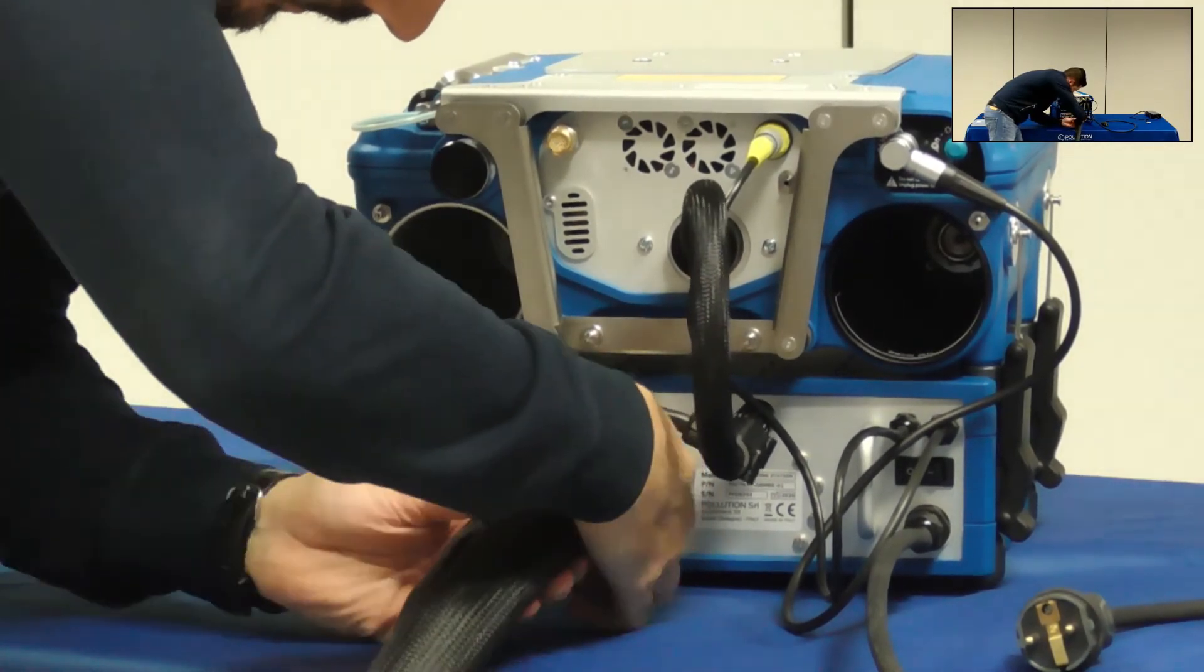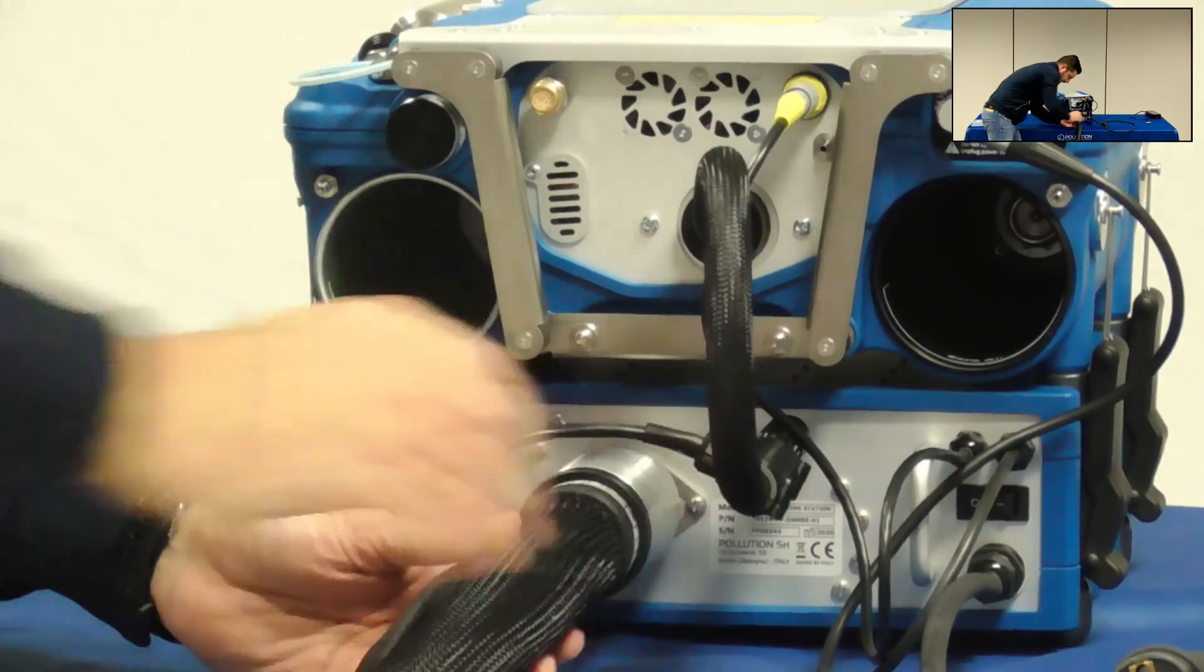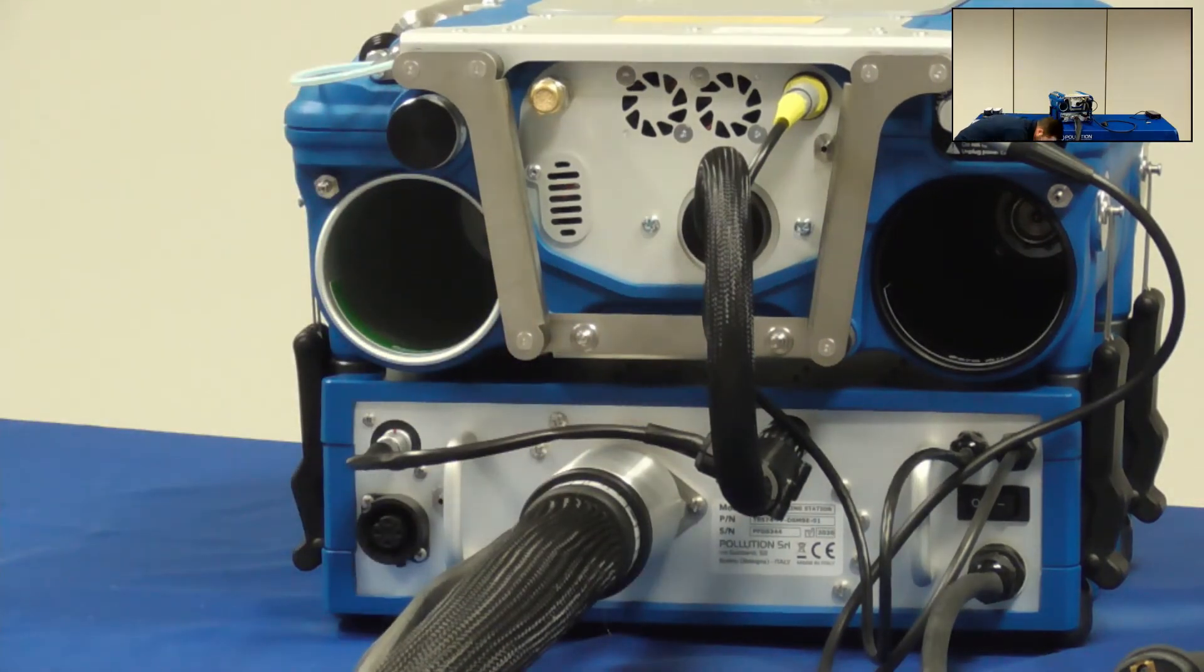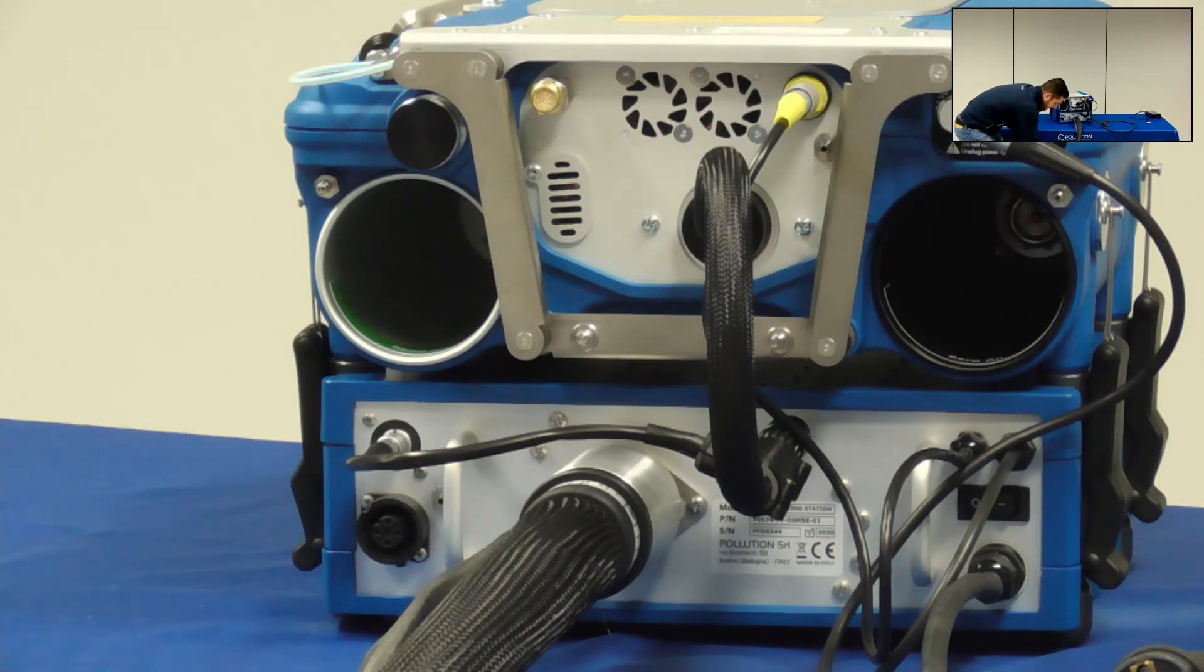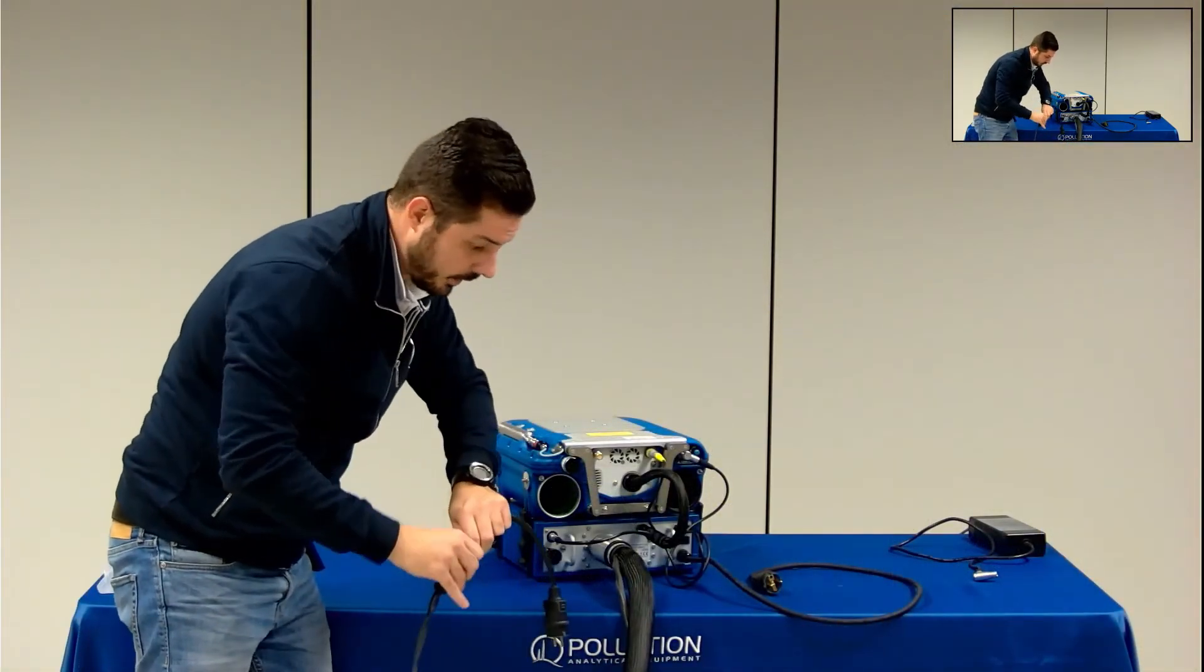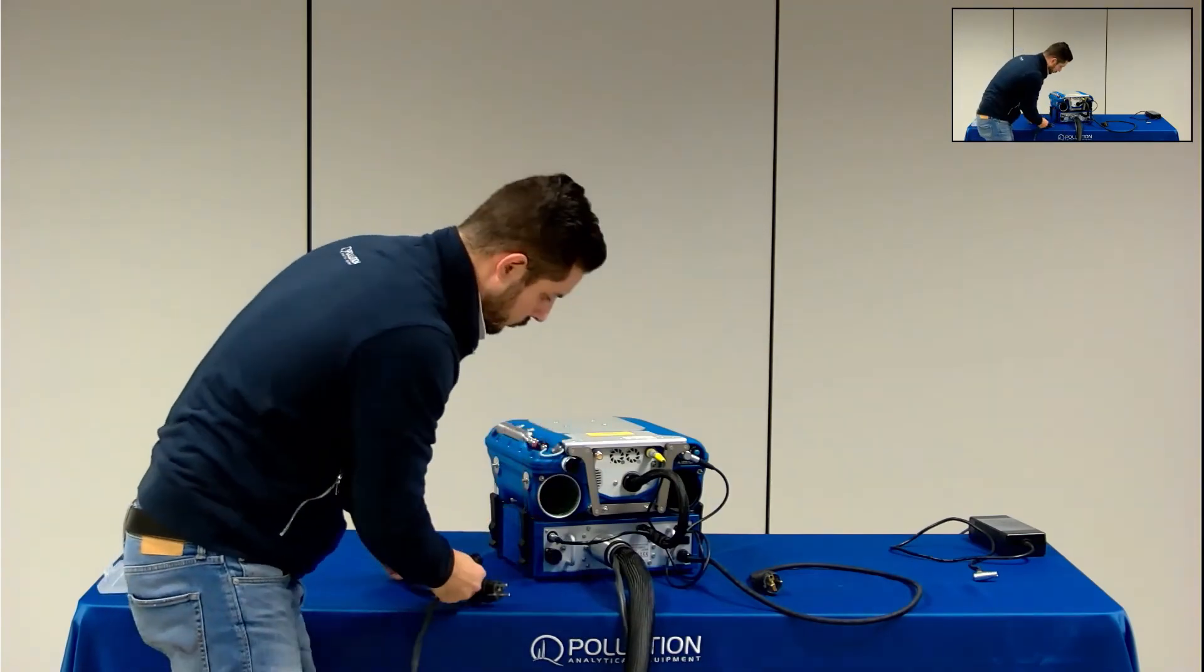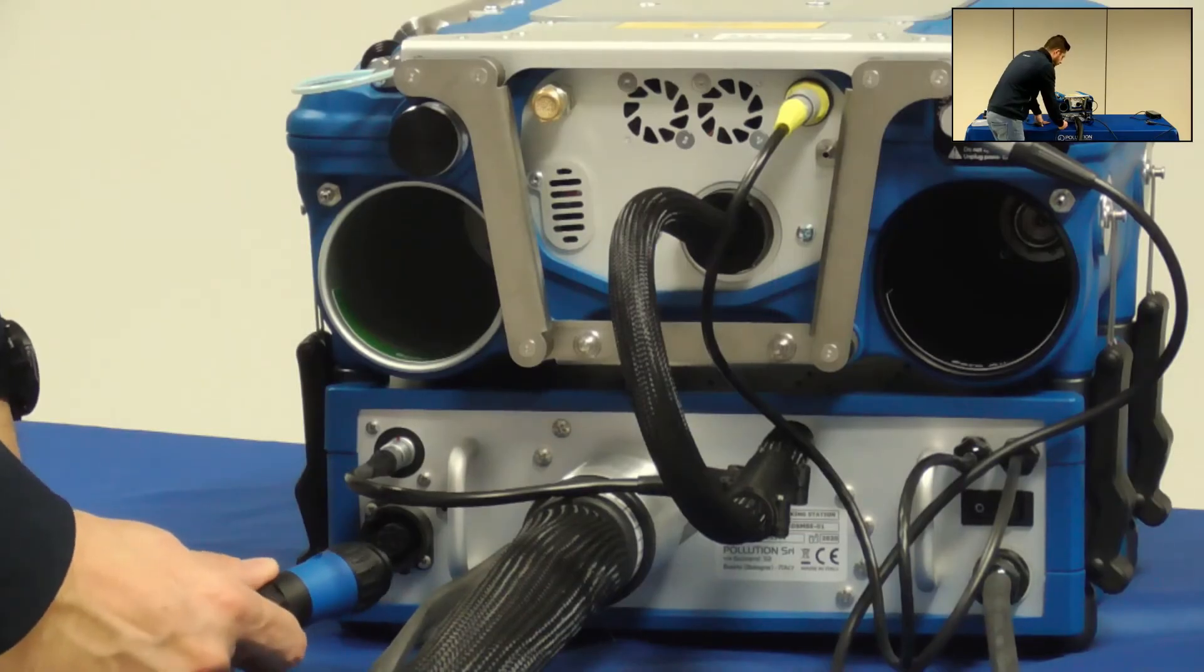After this is done, you can take the power cable of the sampling system and plug it in its appropriate spot. First you need to disconnect it from the Shuko cable and then put it here.